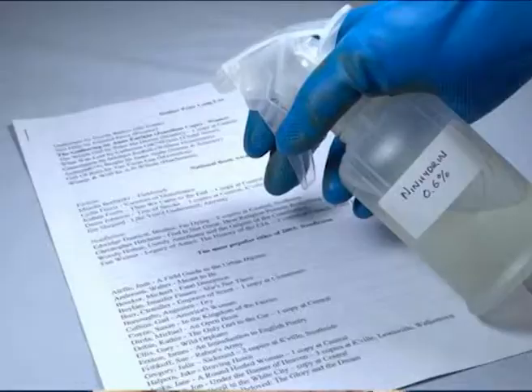In order to avoid these problems and to improve the working performance of Ninhydrin reagent, the procedure for fingerprint development may be modified. The modifications involve the conversion of non-fluorescent Ruhemann's purple deposited along the ridges into a fluorescent derivative by post-treatment of the developed prints with a suitable metal salt. The fluorescent deposition shows a marked enhancement in clarity and sharpness when illuminated by a light source.